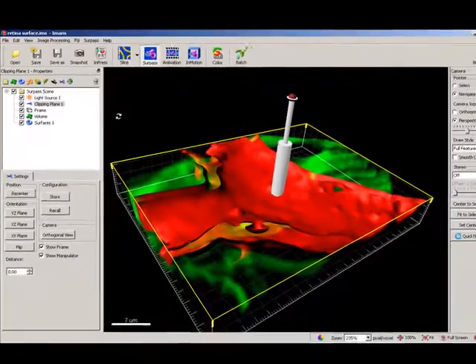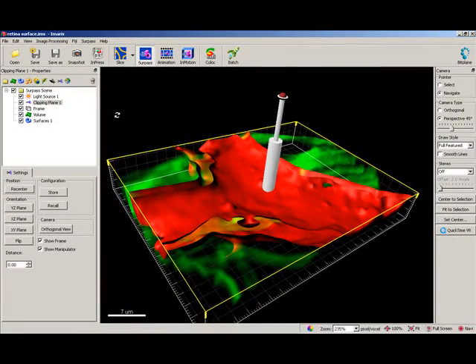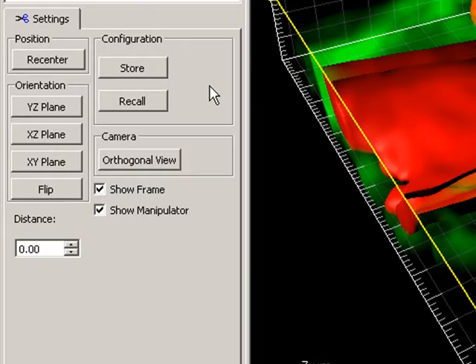The clipping plane selectively cuts away a portion of the dataset using a plane which can be oriented in any desired angle. In the viewing area, the clipping plane consists of a coloured frame with a white double spindle in the middle. In the Object Properties area, the Clipping Plane Settings tab appears. Under the Settings tab, you can adjust the position and orientation of the clipping plane.